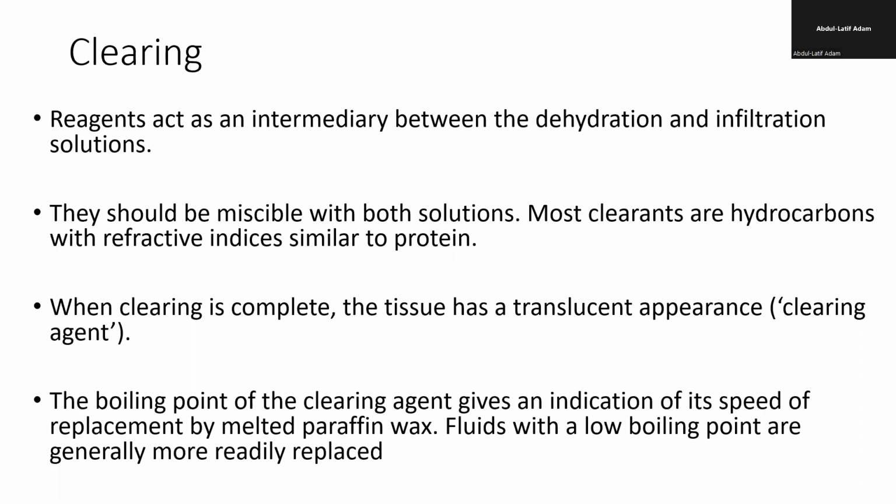Another point that you should consider about clearing is the boiling point of the clearing agent. That influences how fast the clearing can occur. So if it has a low boiling point, then it can easily be replaced. Okay, but if it has a high boiling point, it means that you need heat to facilitate the replacement.